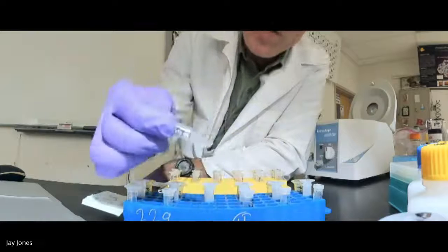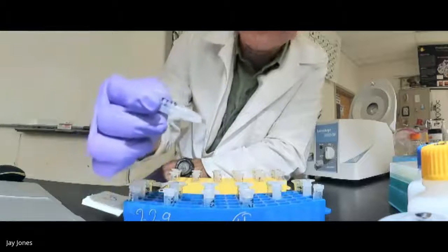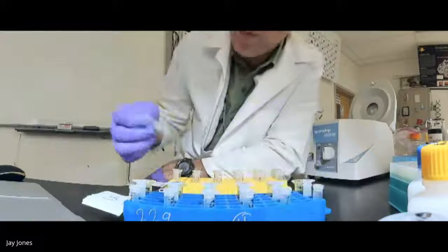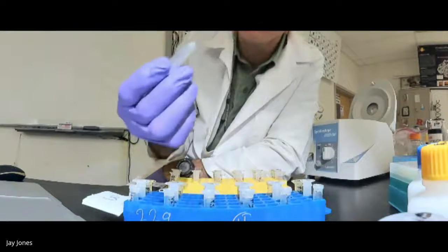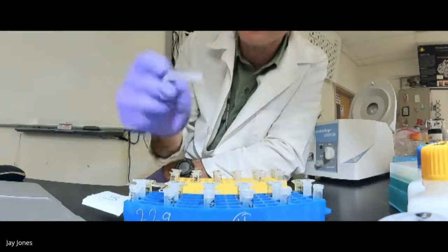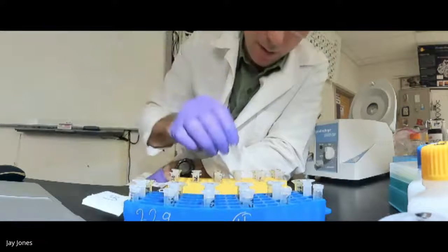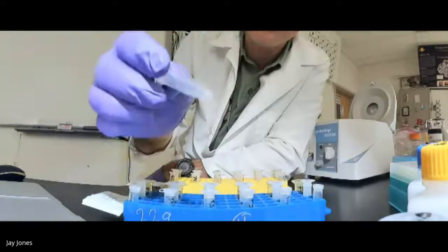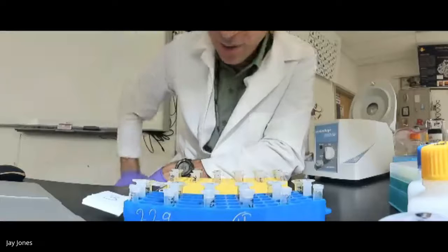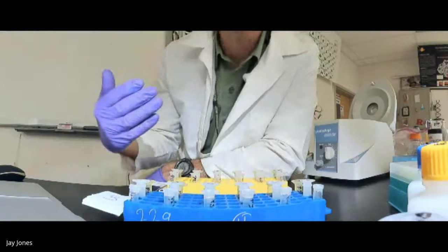And I like these. Look. So how do I know this worked? Each one is dissolved. That's what soaps do. They dissolve things. And that's what I want. I want these cells to dissolve. I want the membranes to dissolve in the liquid. I want the ribosomes and the enzymes and the DNA, everything to dissolve. I principally want the membranes dissolving. Good. And I know it's done when I see a dissolved state. Good. All right. So now our soaps have done their job. They've dissolved the cell membranes.